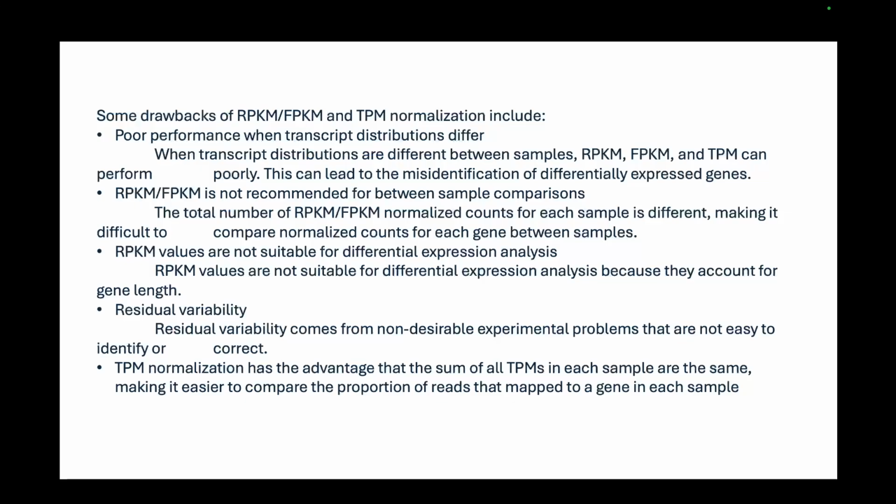If your sequencing depth affects the number of transcripts that are getting generated, then you also need to account for that. So whatever question you're trying to answer and whatever confounding variables can affect that question, you need to account for all those things and normalize accordingly. These are standard normalization procedures. There can be other types of normalization as well, where depending on your requirement, you normalize according to whatever metric might answer the question you're asking.